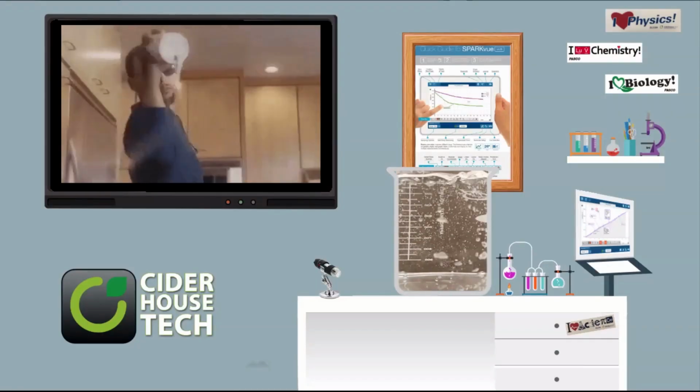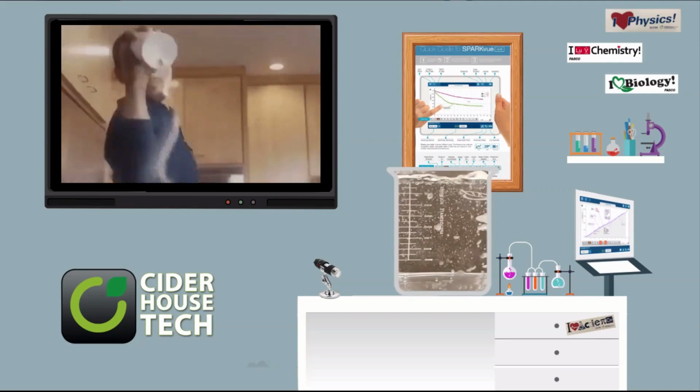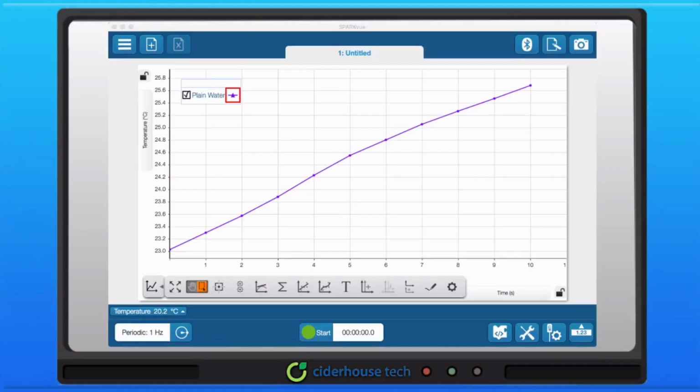Now we are going to add salt to the water. Before we record our run with the salt added, we are going to make a prediction about what our graph will look like when the salt has been included. To do this, we use the prediction tool to draw a rough line of where we think the data will appear. Select Done when finished. We are now ready to collect more data from our boiling points experiment.